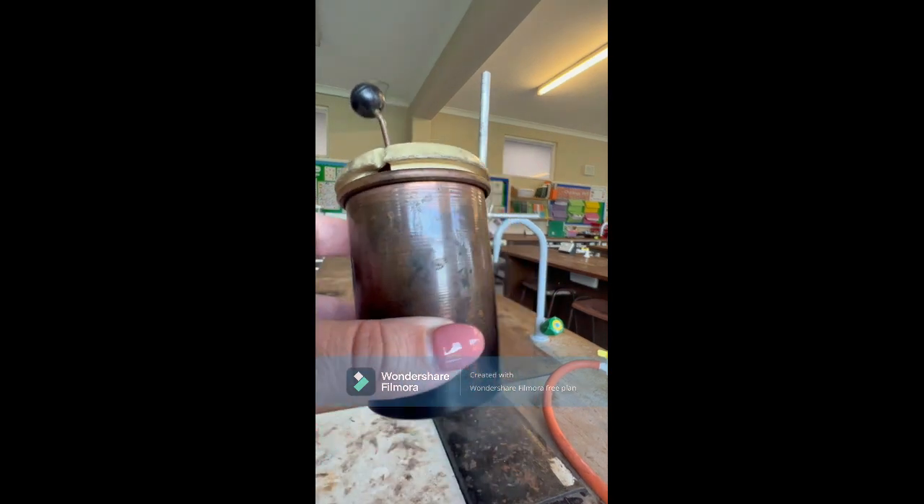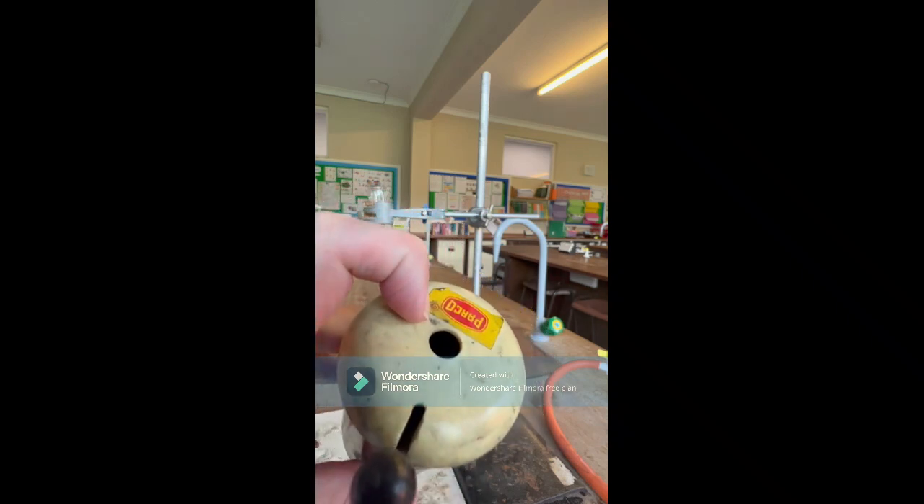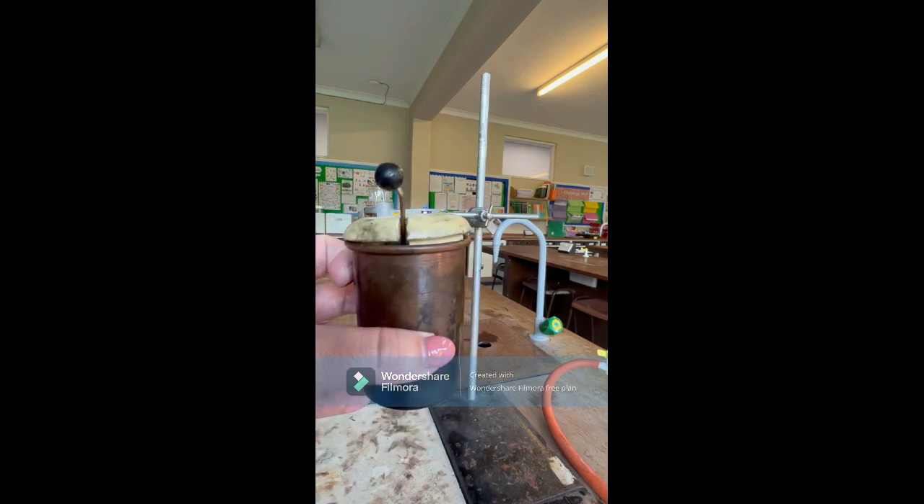Quite often, scientists use a specific piece of equipment called a calorimeter, which is this. It's made of copper with a lid that has a hole so you can put a thermometer in, which you use to heat your food underneath it. It contains water, and you look at how much energy is transferred by the temperature change. There is a more accurate piece of equipment called a bomb calorimeter, which is similar but more insulated — it has an extra layer of metal inside, a more sturdy lid, and a stirrer to move the water around. A bomb calorimeter is the most accurate piece of equipment we have to measure energy transfer because it limits energy transfer to the surroundings.